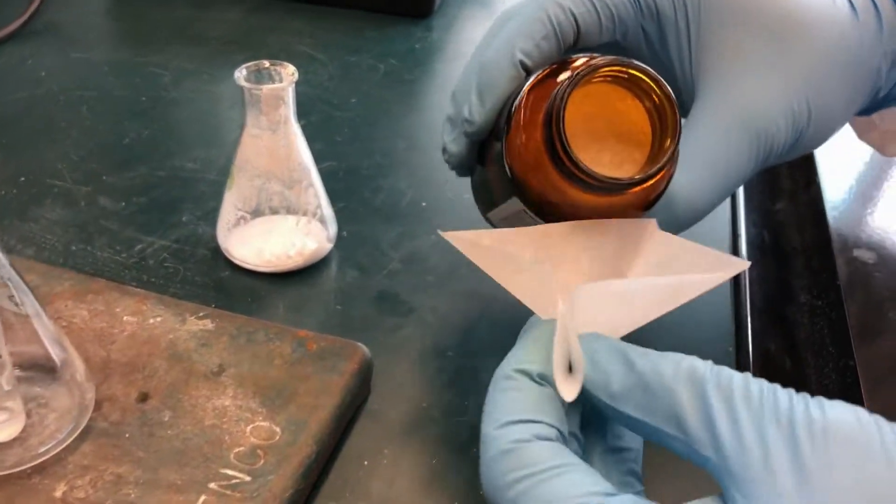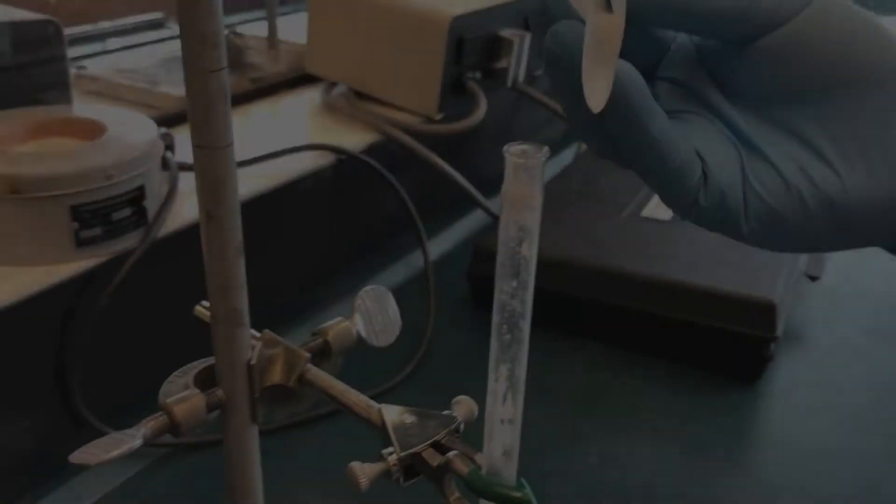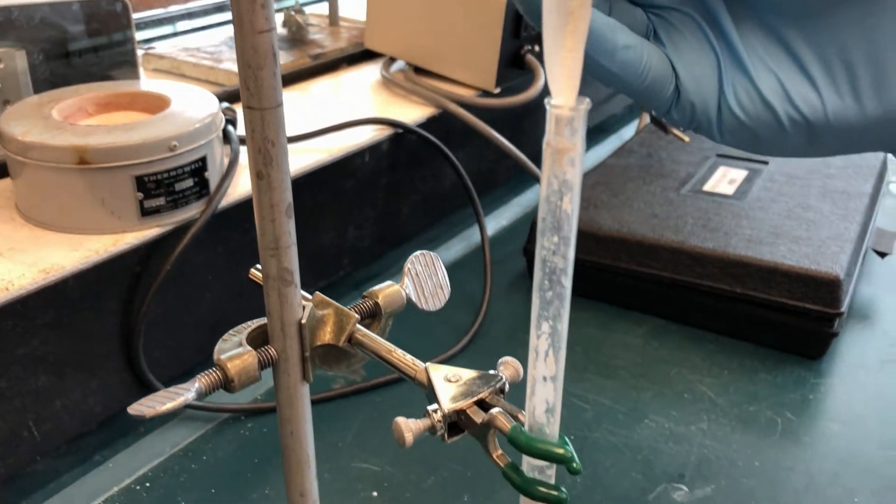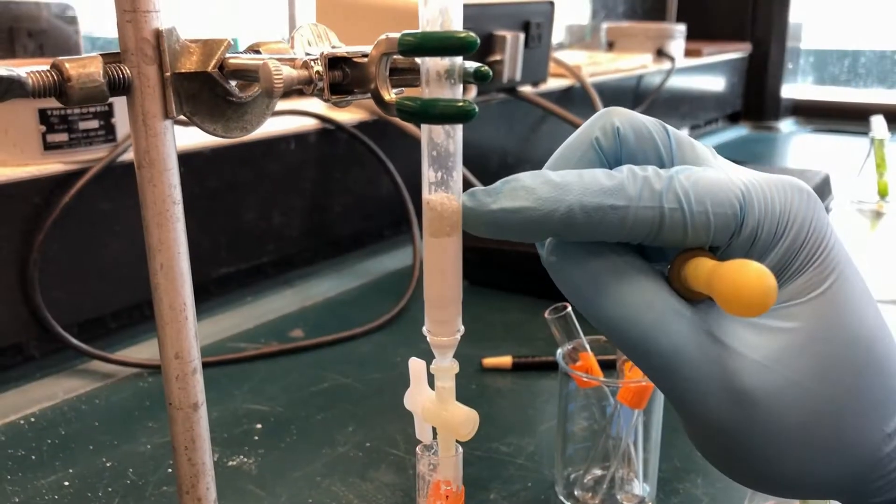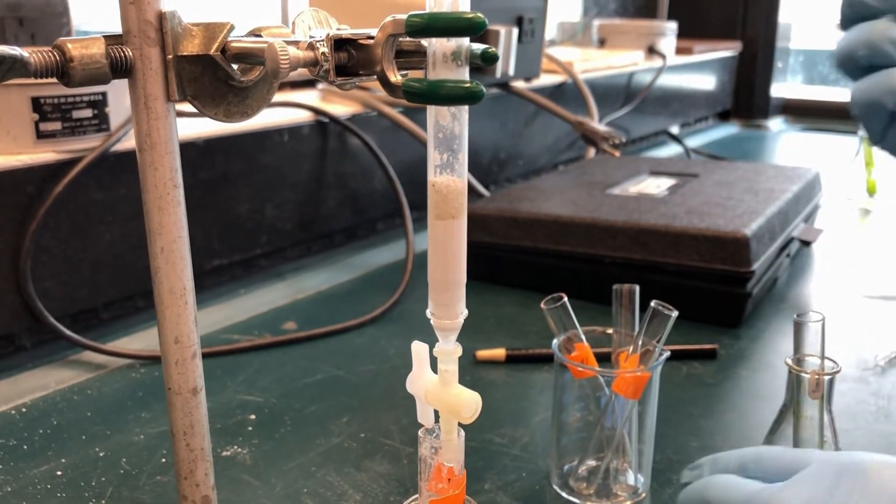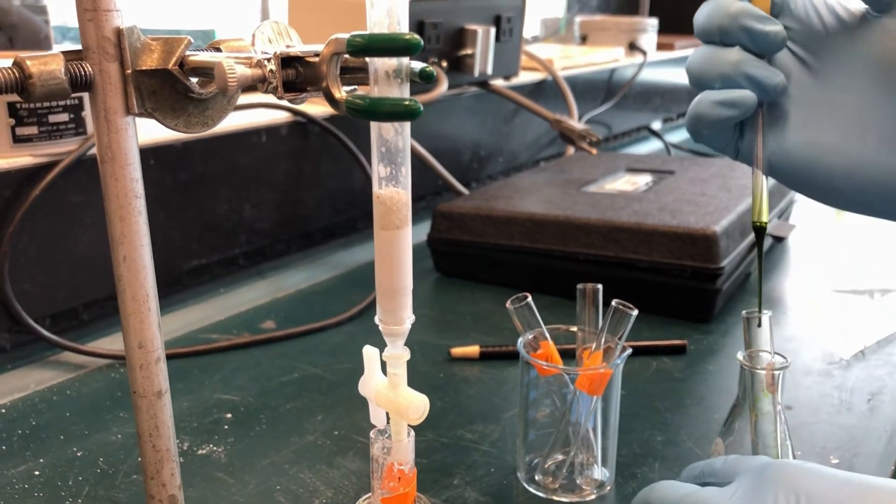Add a quarter inch of sand to the column as in part 2, making sure the sand is level. Once the remaining petroleum ether is nearly absorbed into the sand, add half of the green pigment to the column.